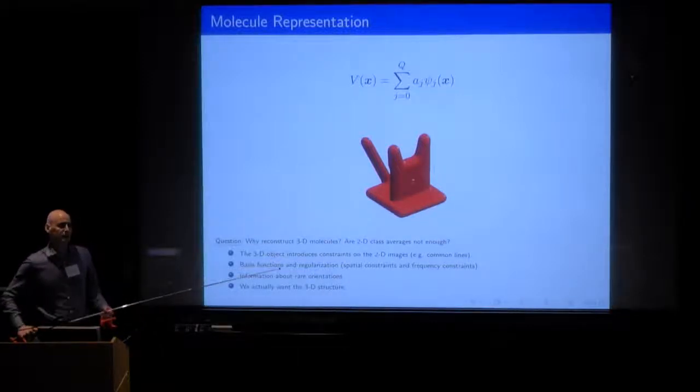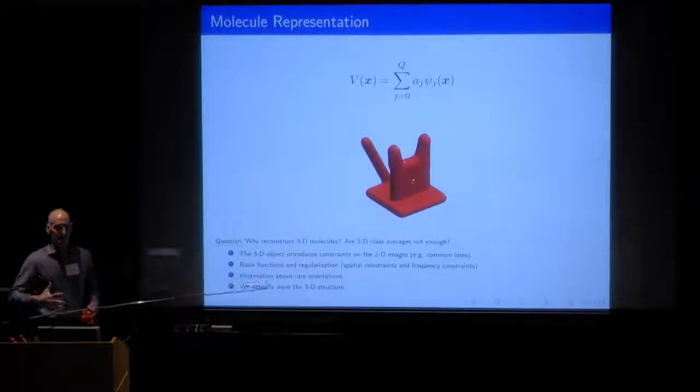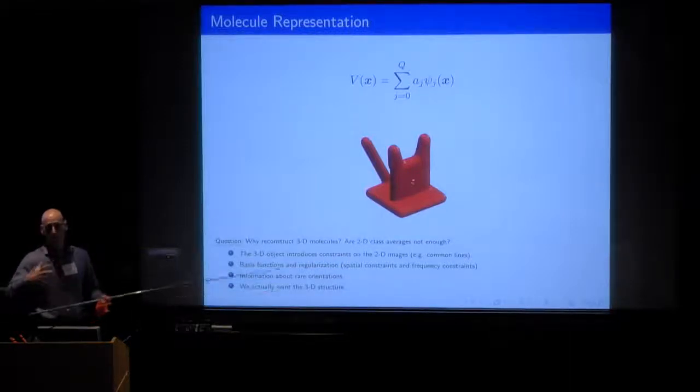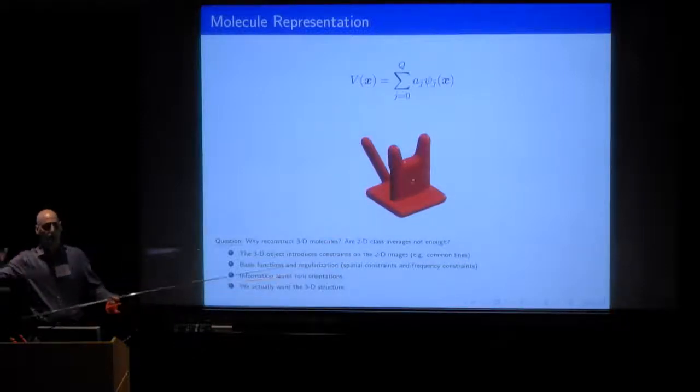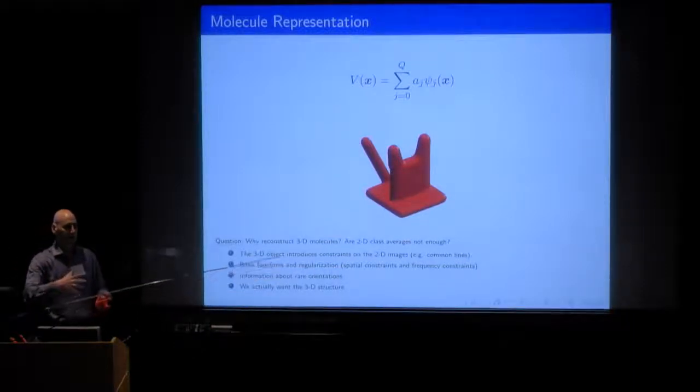These help us regularize the object because we're assuming that the object is band limited to some extent, and that it doesn't live everywhere. We're assuming that it's contained in a compact domain in space. Well, you can't really have both, but as much as you can.